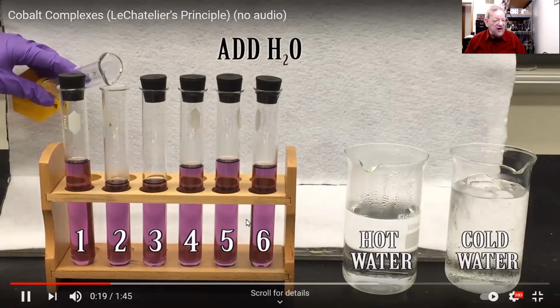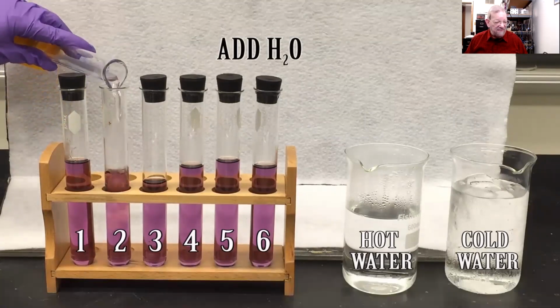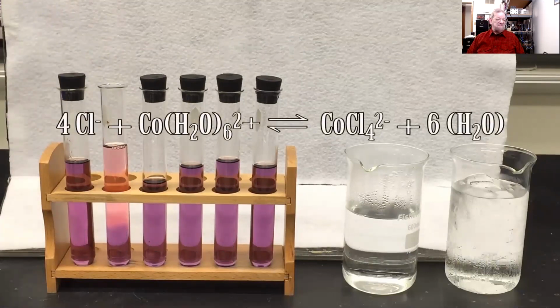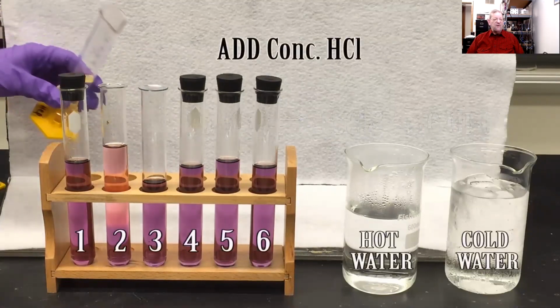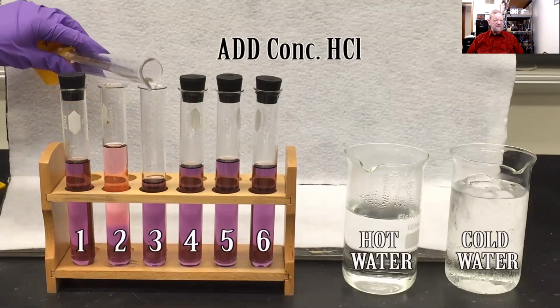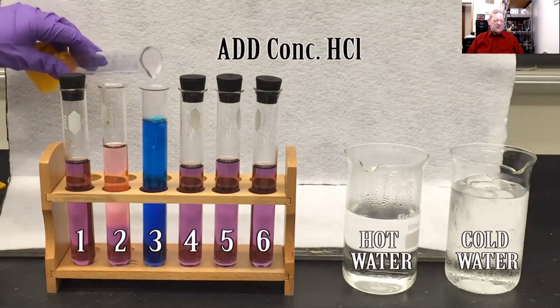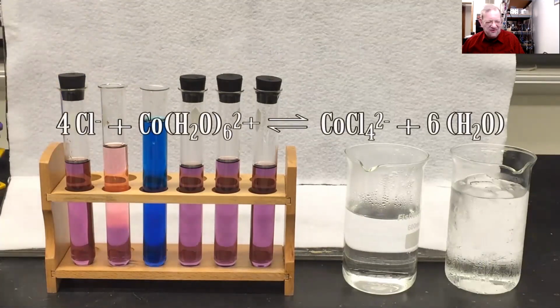Watch what happens to the test tube color when you add water. It stays that sort of pink color. Now we're going to add the HCl. Oh, look, it turned blue. Is that cool or what? Isn't chemistry exciting?